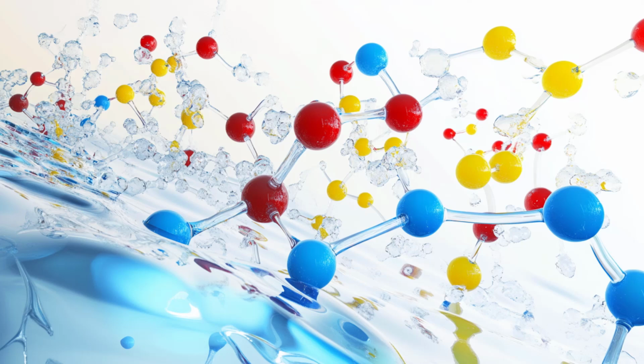High-performance liquid chromatography, HPLC, uses high pressure to force the liquid through the column, resulting in faster and more efficient separation. For example, HPLC is used to determine the caffeine content in beverages like coffee and tea. LC is like a sieve sorting objects of different shapes and sizes as they pass through.